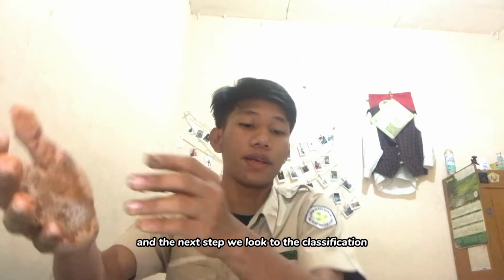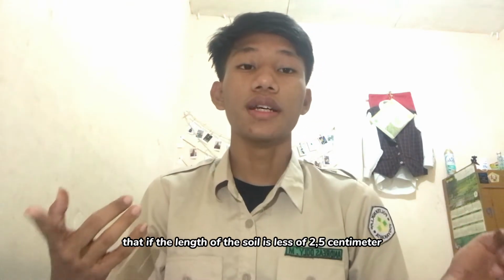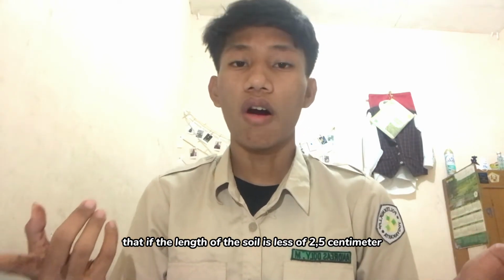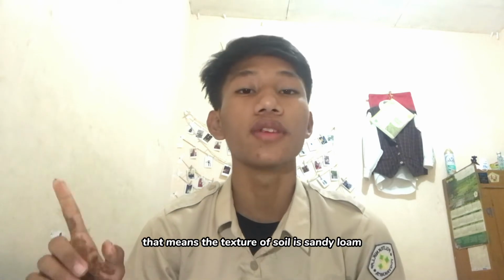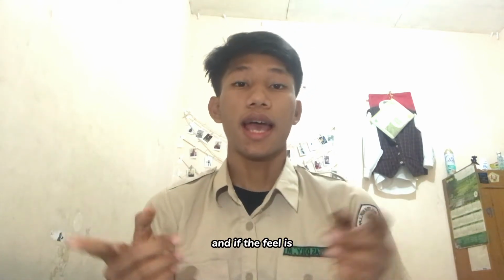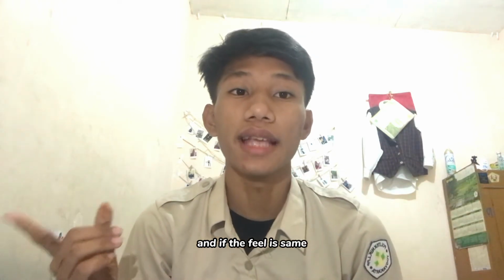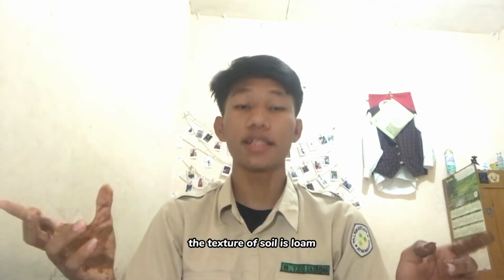And the next step, we look at the classification. If the length of the soil is less than 2.5 cm and the feel is rough dominant, that means the texture of soil is sandy loam. And if the feel is smooth dominant, that means the texture of soil is silty loam. And if the feel is the same, meaning rough and smooth, the texture of soil is loam.